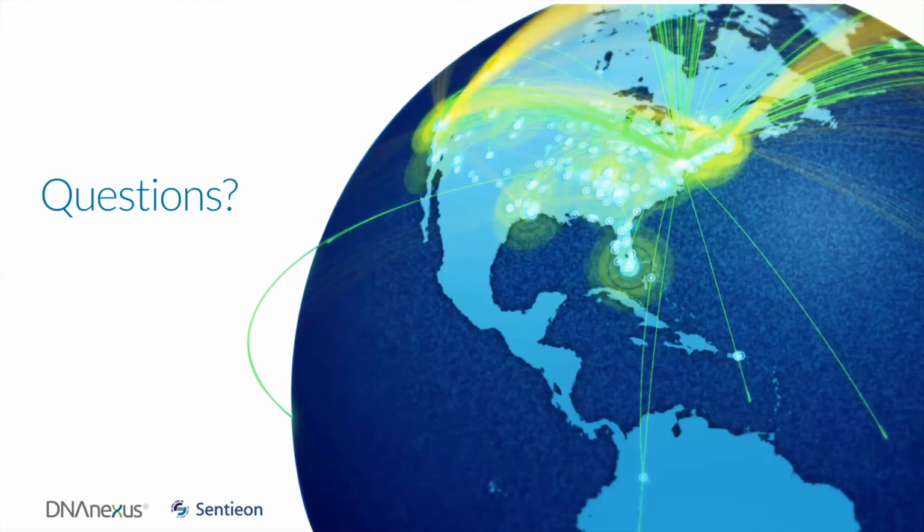I think joint call might be joint genotyping on just the GVCFs, right? Yeah, that's a good clarification. It's joint genotyping using the GVCF files. The variant calling is going to be done independently on every sample with the haplotyper in GVCF mode. And I believe we have a distributed genotyping app, which will split this up. I think we've done several thousand whole genomes already and probably tens of thousands of exomes.